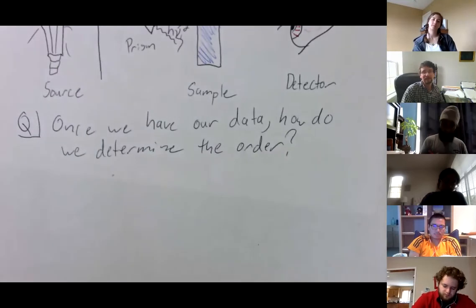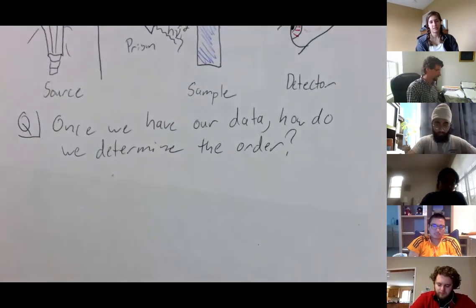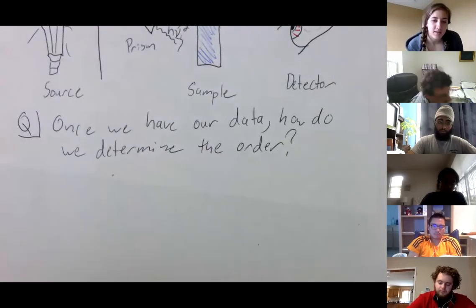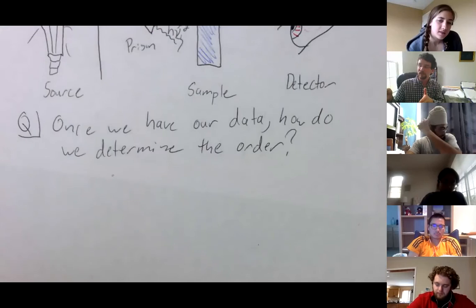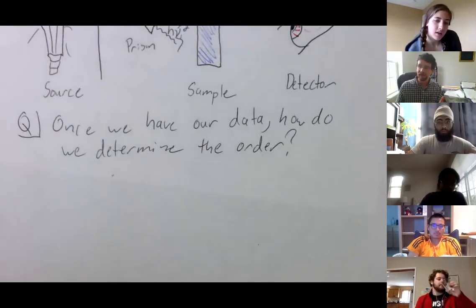So luckily you guys don't have to go through and collect the data. The data is all online for you. But let's say you collect your data. How would you analyze it? What are you going to do next? You compare experiments. Don't you compare the experiments? We could compare experiments where we look at different concentrations, right? Like you've done in class. However, this time we only have one concentration.